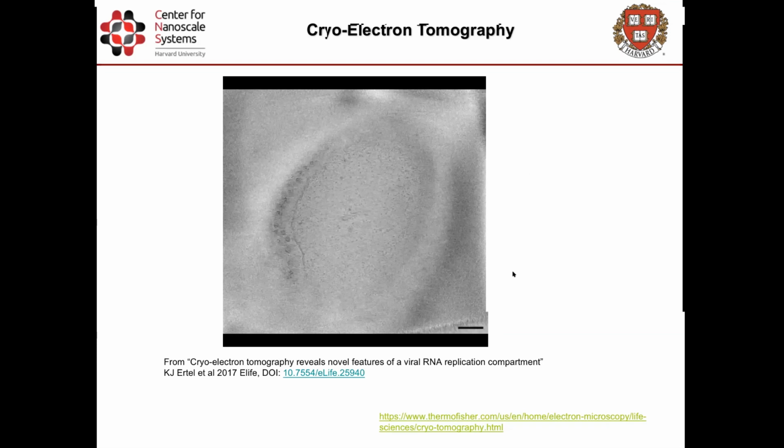which can then be loaded in a Cryo Electron microscope. Now we have this Cryo-FIB, which Stefan is working with, and we hope then we will combine and set up the Cryo Electron tomography workflow on our Cryo-EM, hopefully by the end of this year. It depends on how the reopening and everything works. And the thing with cryotomography is that we cannot put whole cells. They have to be sectioned. To get this resolution, you shouldn't really be above a few hundred nanometers thickness of these sections.